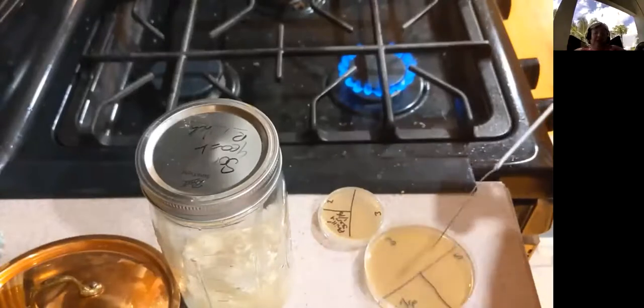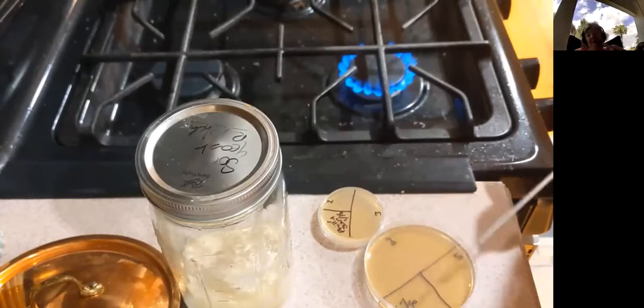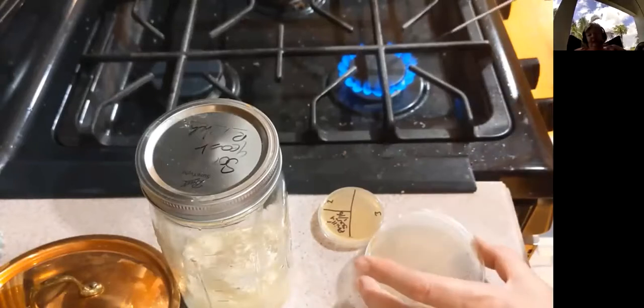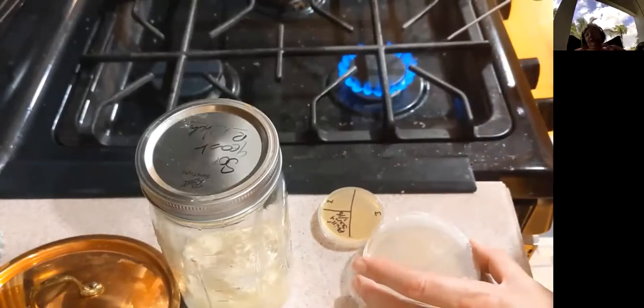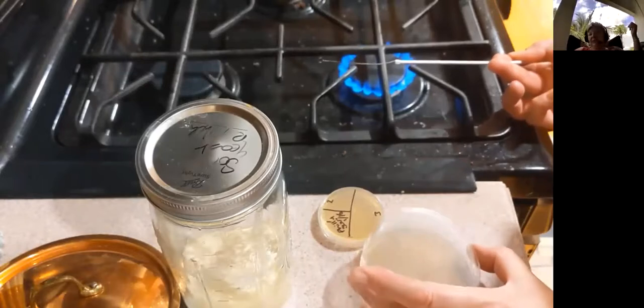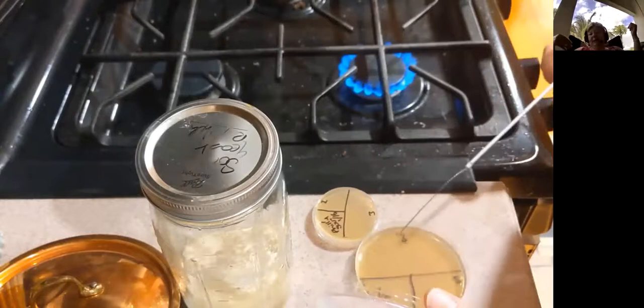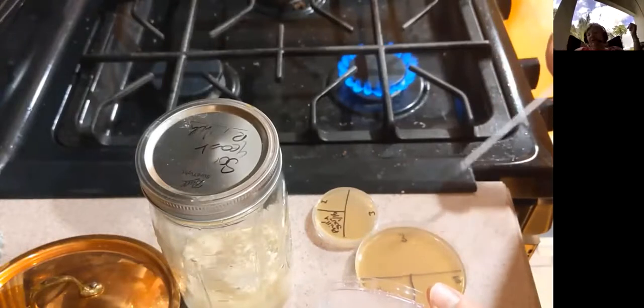I'm going to then spread it in segment 1, just a little bit. Close my lid, sterilize my loop again by heating it up red hot. That gets rid of any of the yeast or bacteria that we'd already picked up. I let it cool. I'm now going to come back to the plate. I'm just going to cool it on the side.